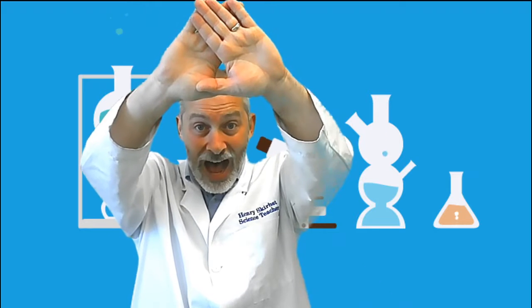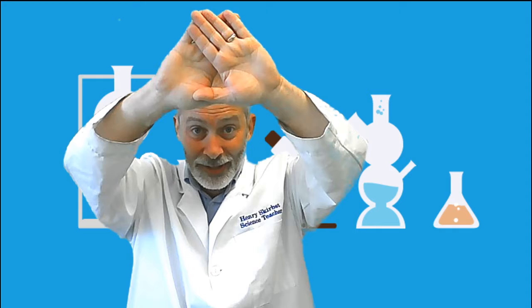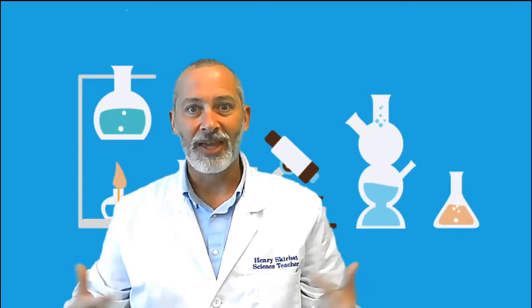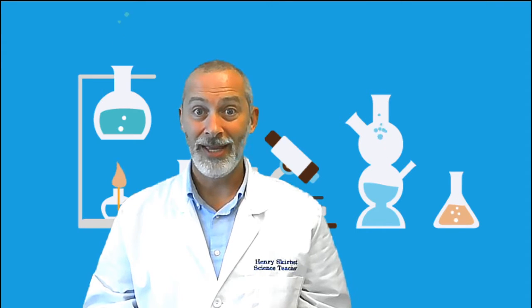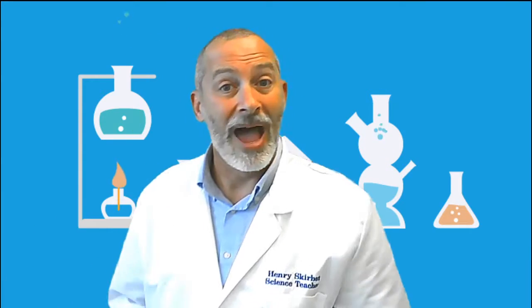One of your eyes, when it's open, will keep the clock in the middle of the triangle. The other eye, when it's open, the clock seems to magically disappear. The eye that keeps the clock in the middle is your dominant eye. Okay? So that is how you determine the dominant eye. Let's head back to our notes here.